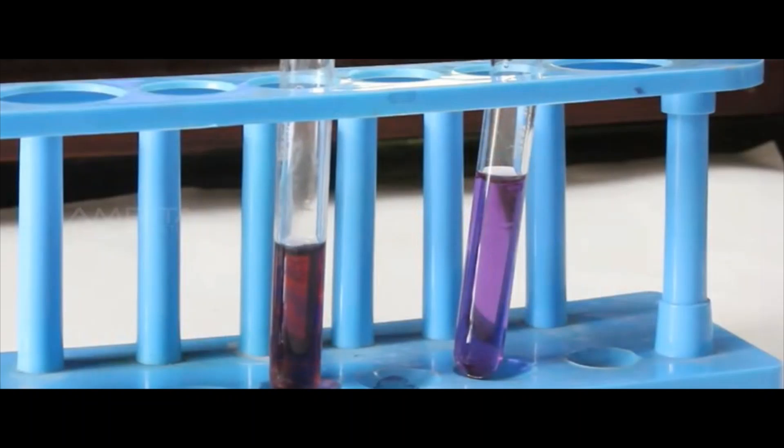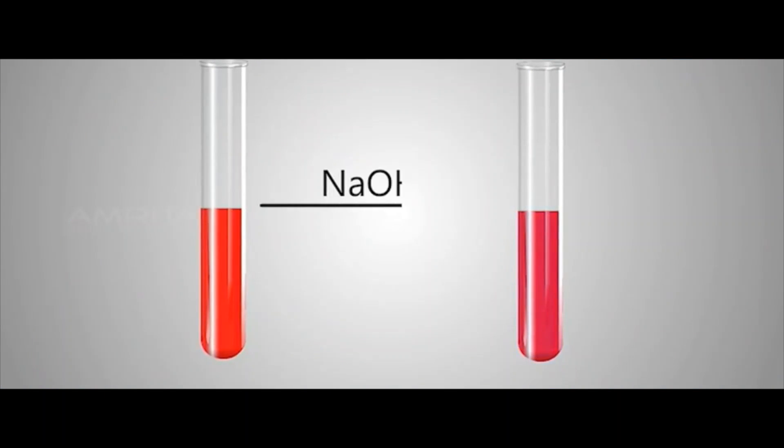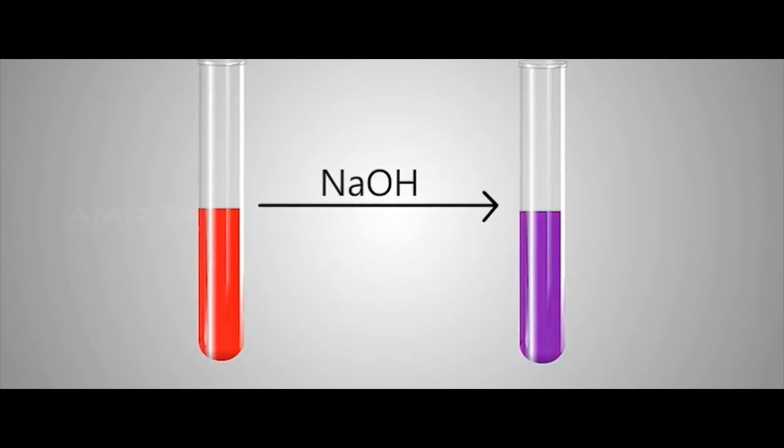You can see that red litmus solution changes to blue, which indicates that NaOH is an alkali having pH more than 7.